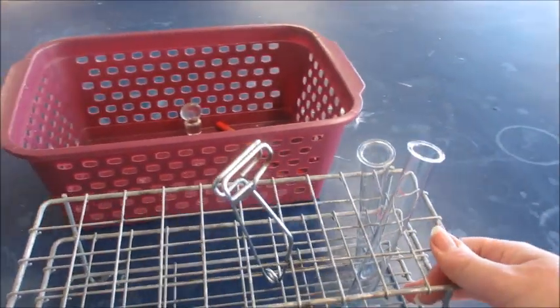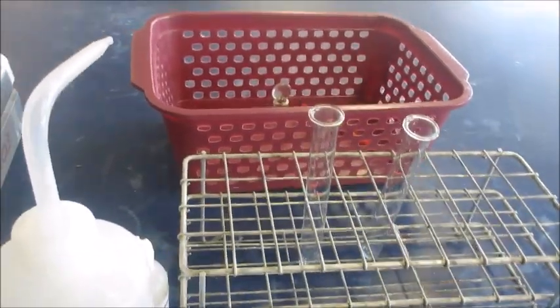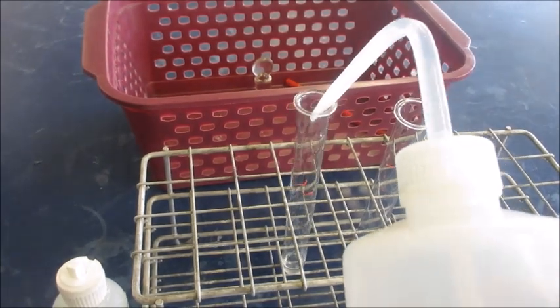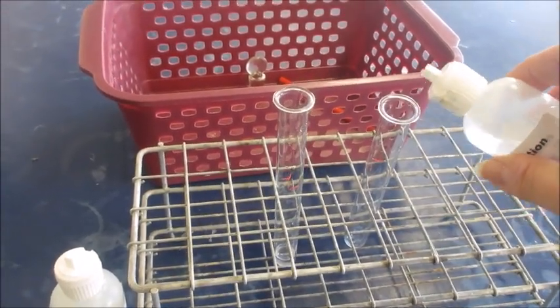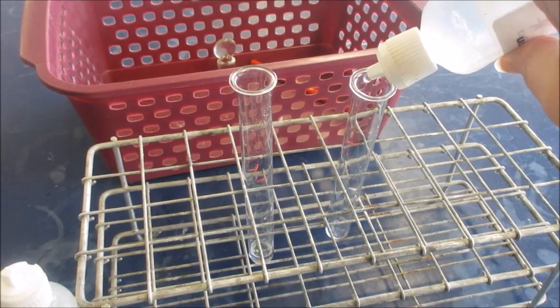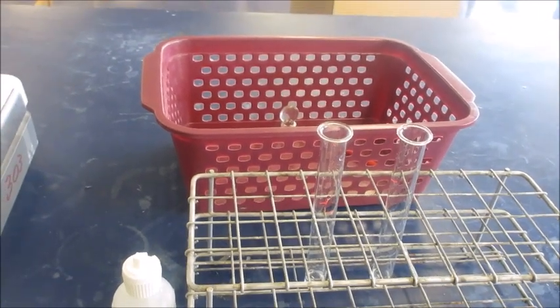Bring the test tubes closer — test tube number one and test tube number two. Place ten drops of distilled water into test tube one, and ten drops of the glucose solution into test tube two. Remember, you always have to test once for water and once for the nutrient. Then add ten drops of Fehling's A and ten drops of Fehling's B into each of the test tubes.